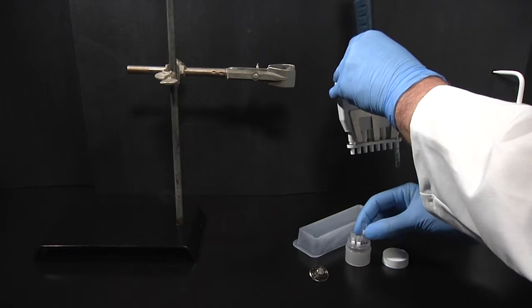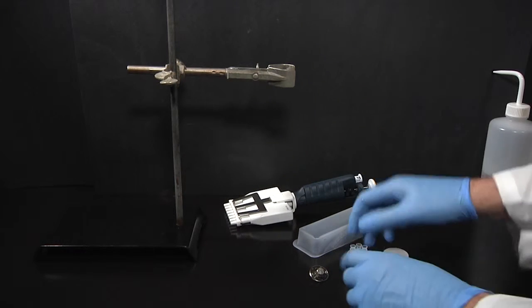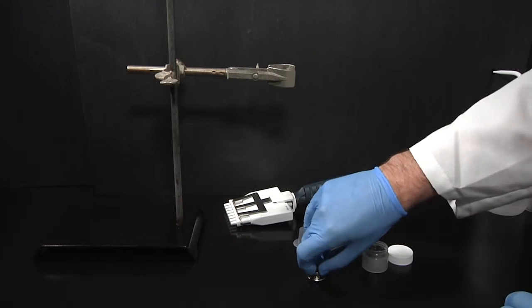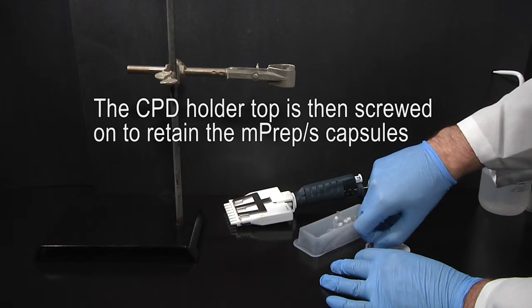Only after the MPREP-S capsules are inserted into the CPD holder are the MPREP filter couplers removed. This is to ensure that the specimens always remain immersed. The MPREP filter couplers are removed after the MPREP-S encapsulated specimens are transferred to the ethanol bath. The CPD holder top is then screwed on to retain the MPREP-S capsules.